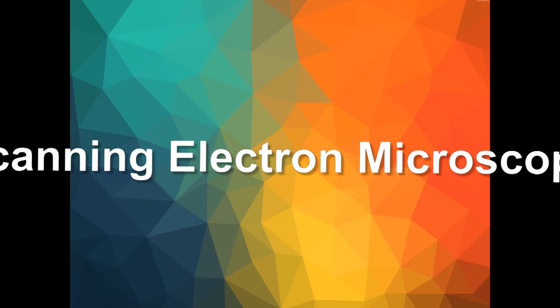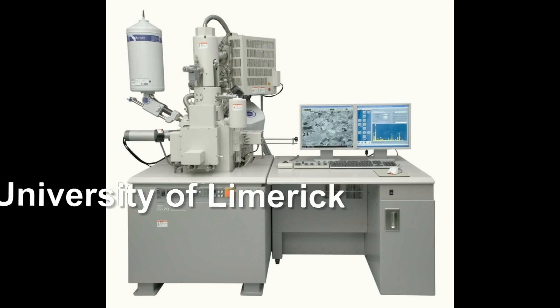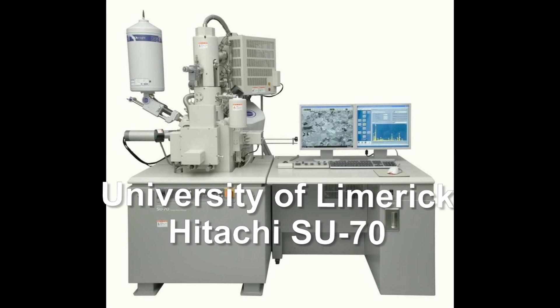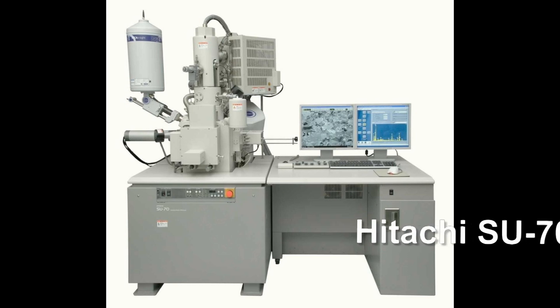Scanning Electron Microscope. The model we have in University of Limerick is Hitachi SU-70. The main components of the microscope are the column for electron beam generation, specimen chamber, vacuum pump, monitor, and control panels.